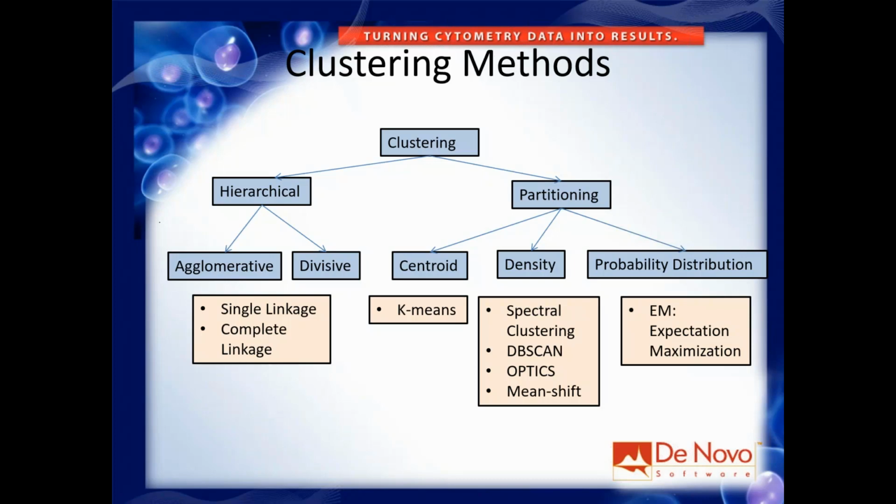By the time you get to use this quote unquote clustering algorithm that's running unsupervised, someone's chosen a distance metric, someone's chosen tuning parameters, someone's chosen a criterion for when the clustering should stop, someone has chosen how the clustering converges. Somebody's made 47 decisions, most of them completely arbitrary, in order to get a very specific goal out of it, but that goal is somewhat arbitrary, and there are generally different ways of achieving that goal with very slight differences between them that can impact the results.